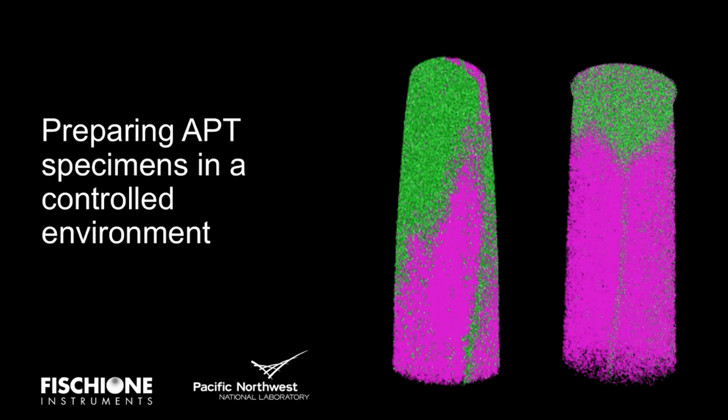Oh, this is a nice question. Can you estimate how much material is removed on the bulk sample by broad ion beam milling? So in the case of oxidized material, it depends on how you keep your material. If it's only on the shelf, exposed all the time to oxygen and atmospheric conditions for a long time, this oxide can grow and grow.